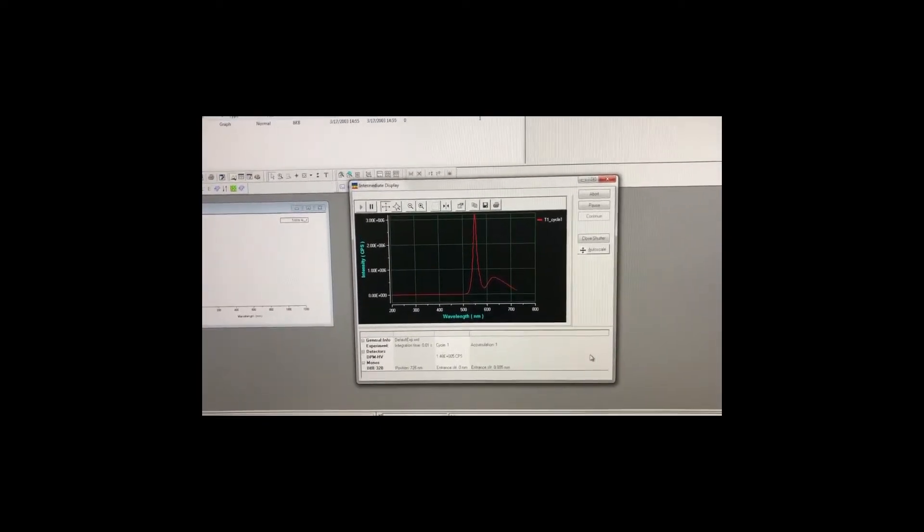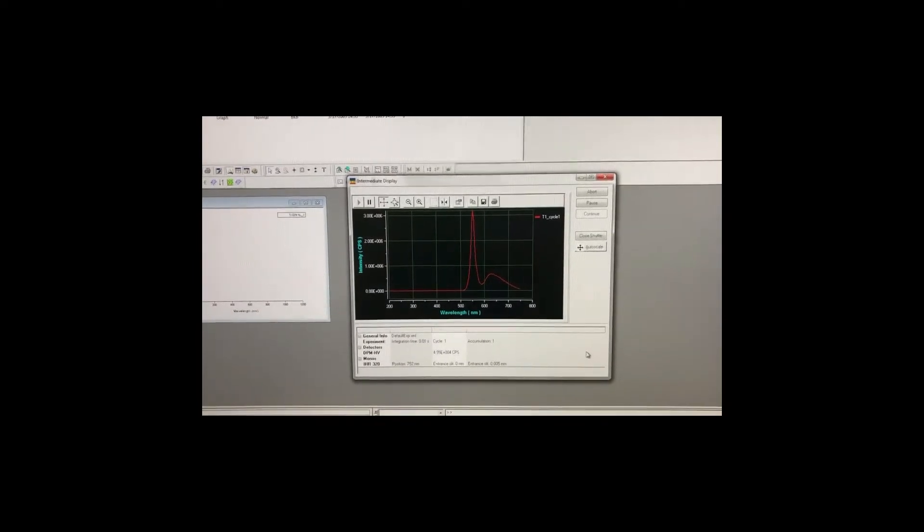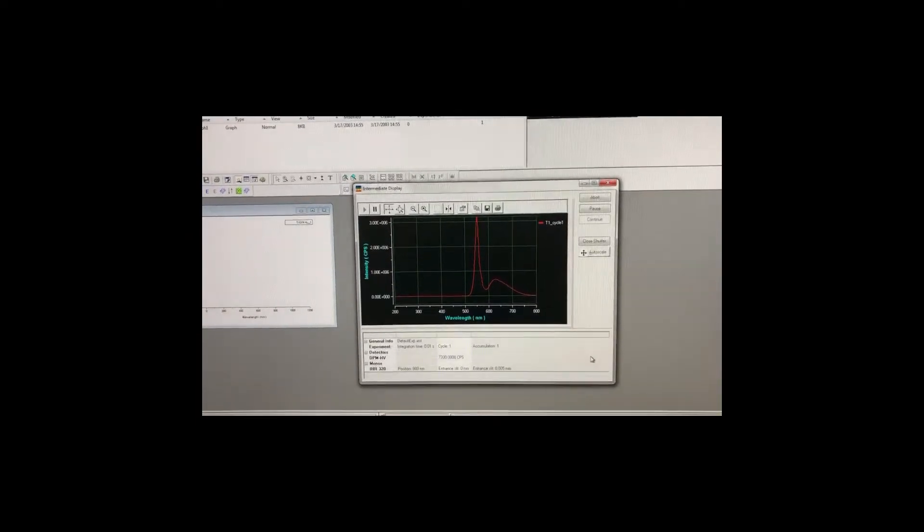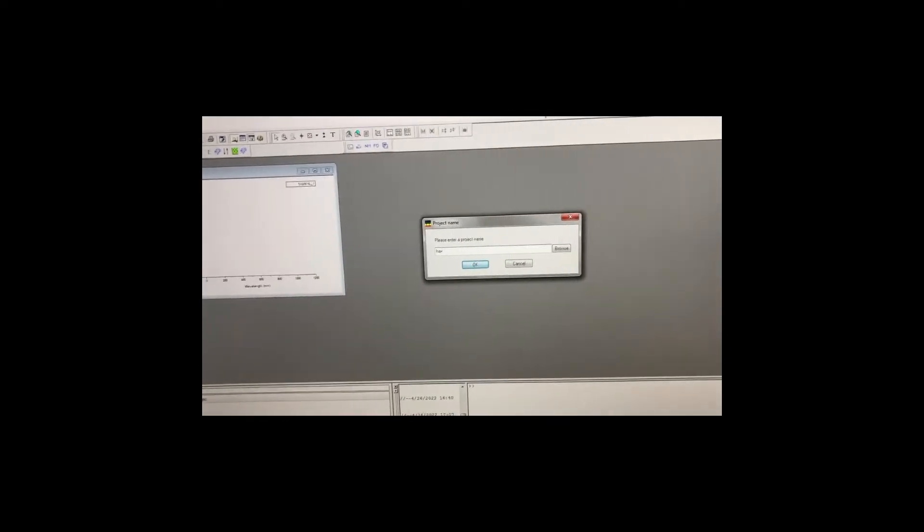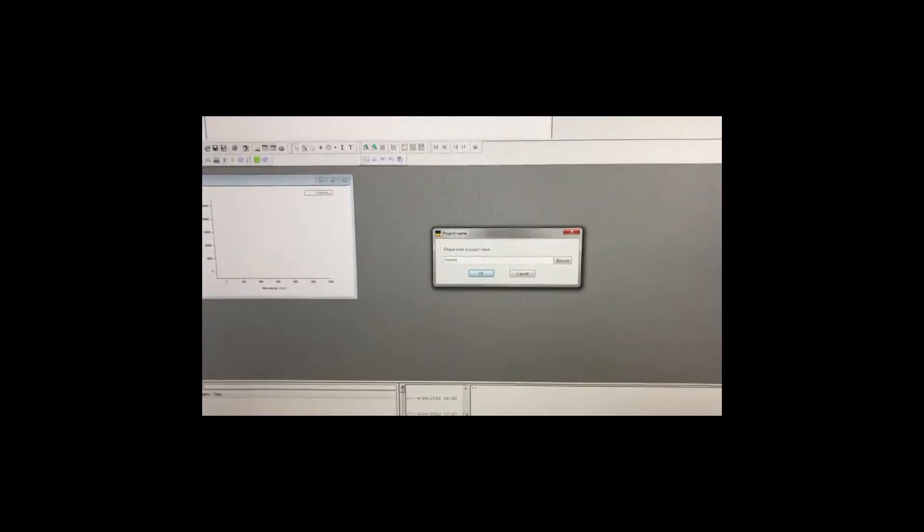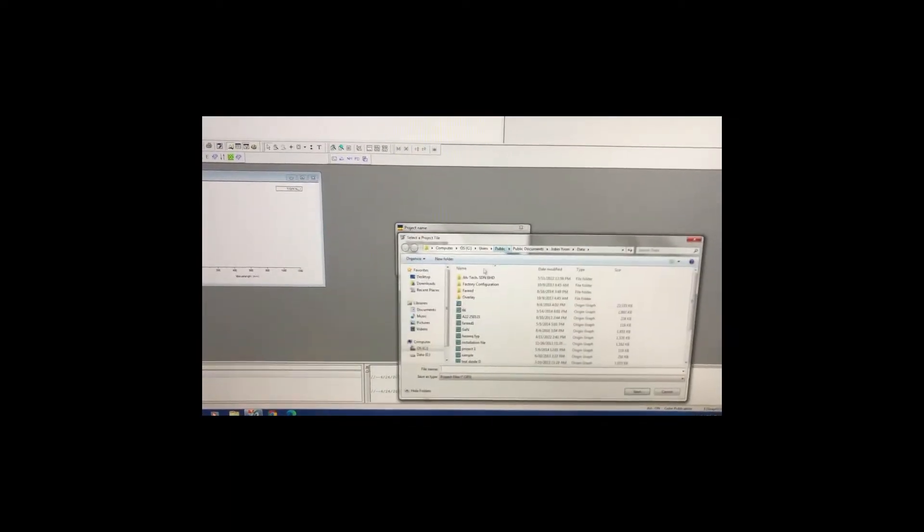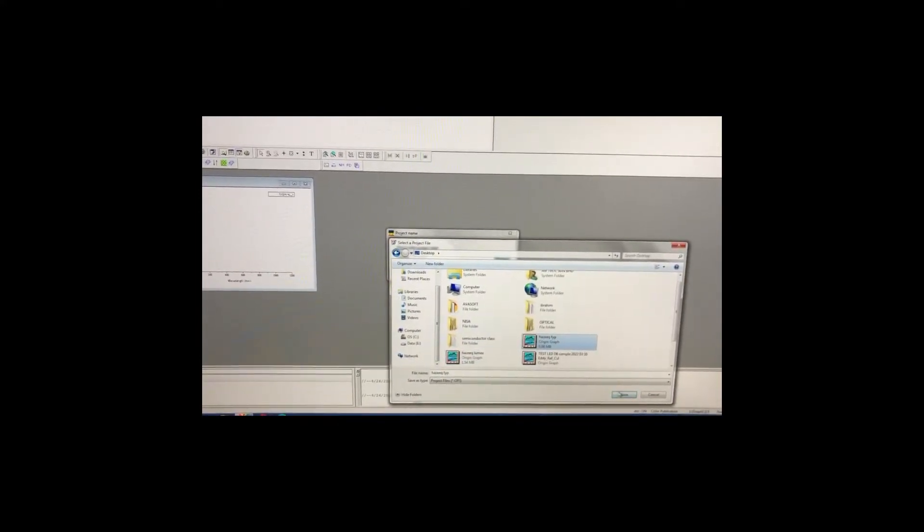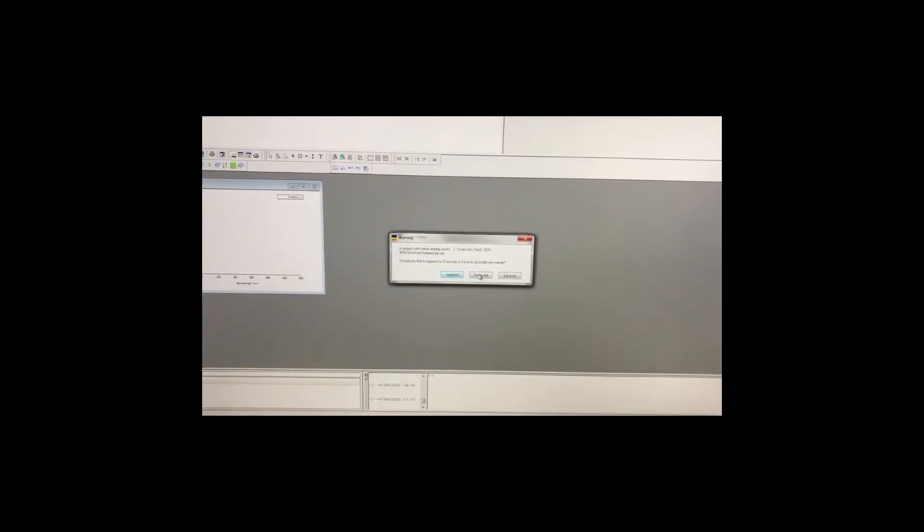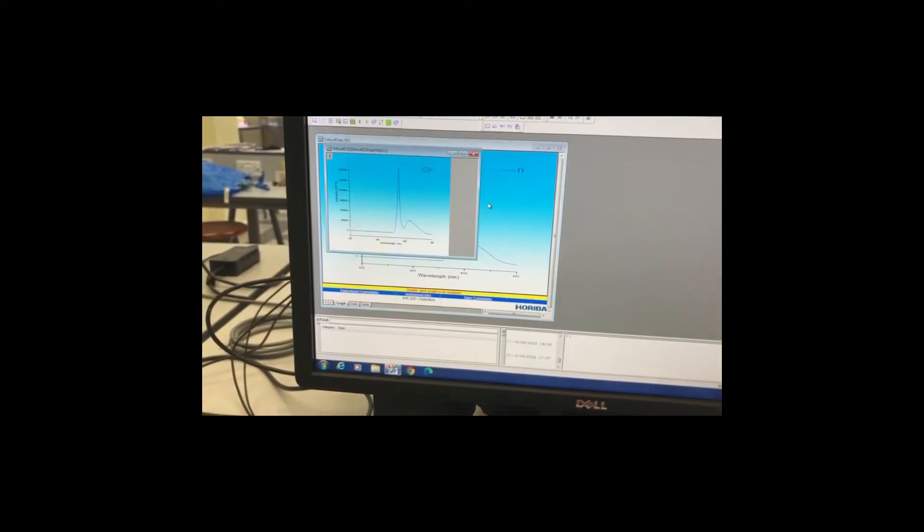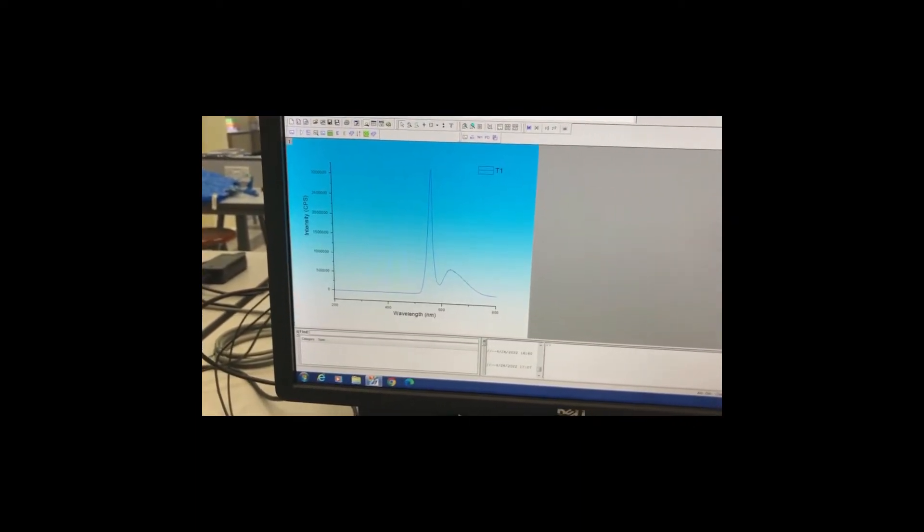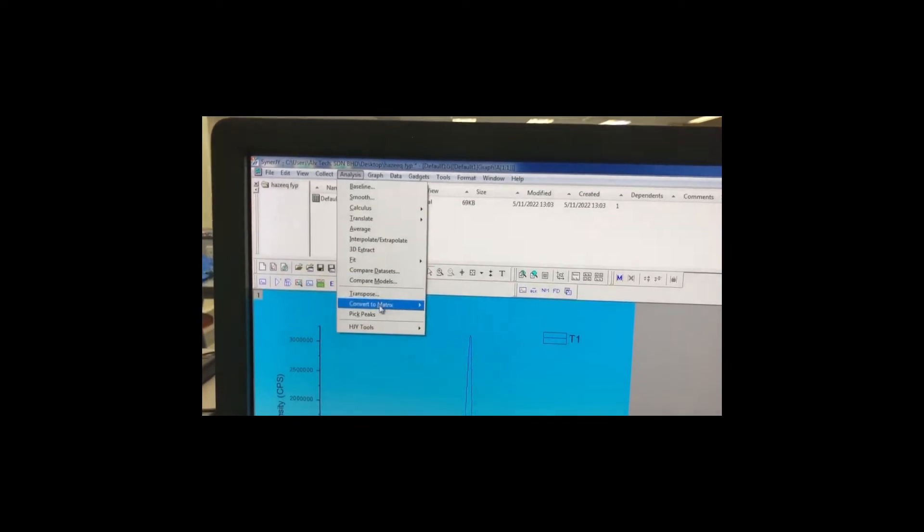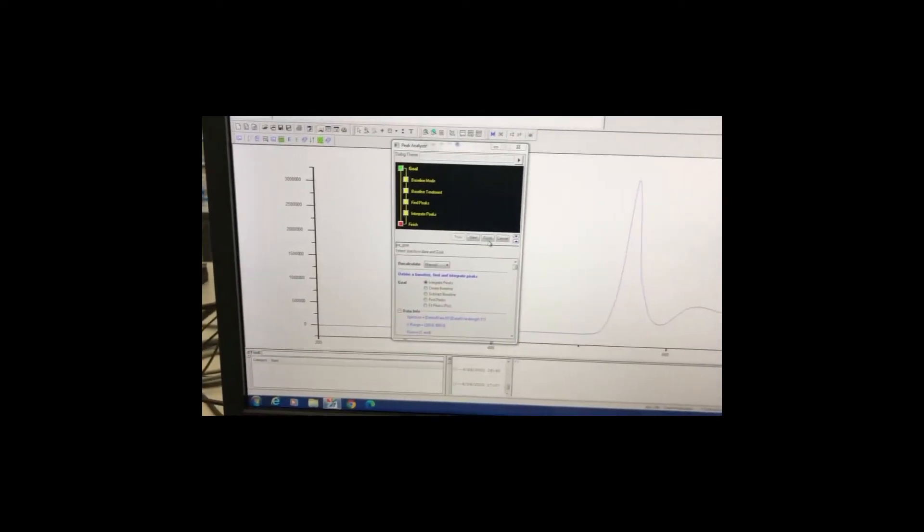It's almost finished. Okay, for example, this is our result. Double click and then you will click on the analysis and then just click finish.